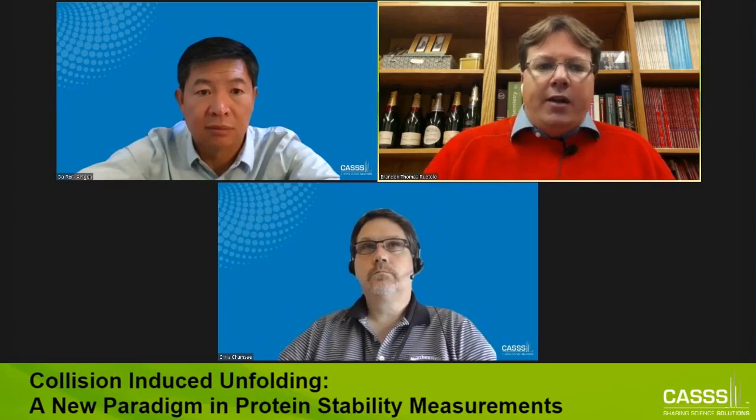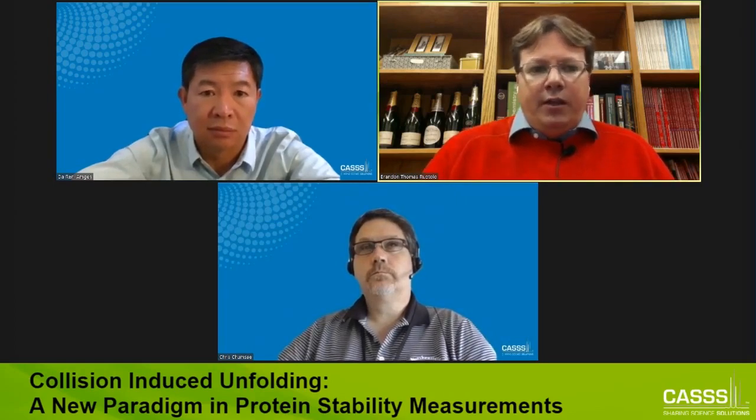So yeah, I think for really high concentrations of salts in solution, it's still an issue, definitely. But for modest concentrations of salts, certainly in the micromolar to maybe low millimolar range for some salts, you can get away with it under some conditions, and you can still get pretty clean spectra, and you can get reproducible CIU data across those types of samples usually without a problem.